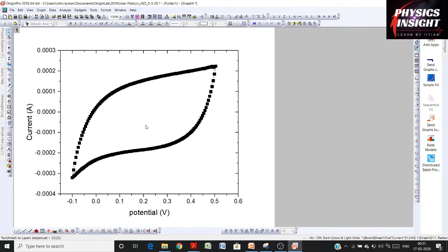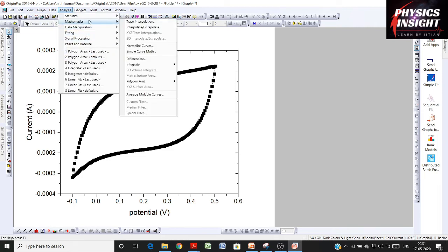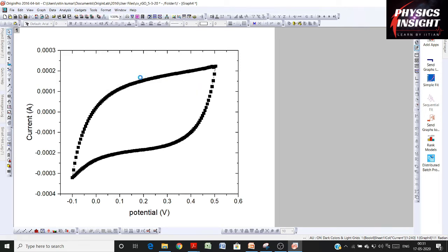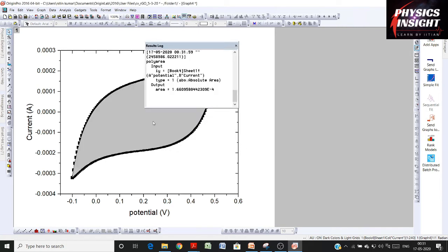Now what we need is to calculate the area under this curve. We can calculate this area by doing Analysis, then Mathematics, Polygon Area, open dialog, and just by selecting absolute area. Here we can find out the area under this curve, that is 1.66 × 10^-4 as we are seeing here.